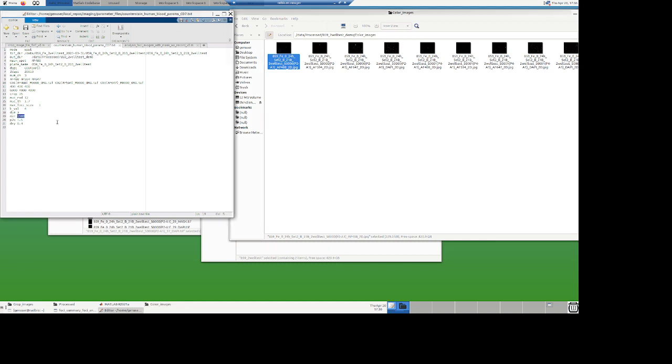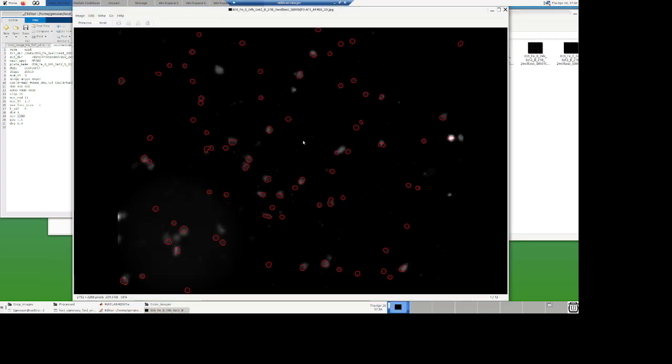That means that any foci that is picked up by the system, the wavelet that is less than 1500 intensity bright will not be considered. It's too small. It's too little of intensity. So that filter will come up later. Right now, it's just showing you my nuclear segmentation and showing to you the different channels.